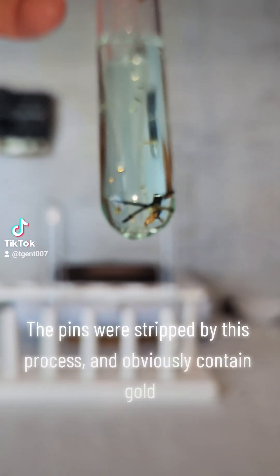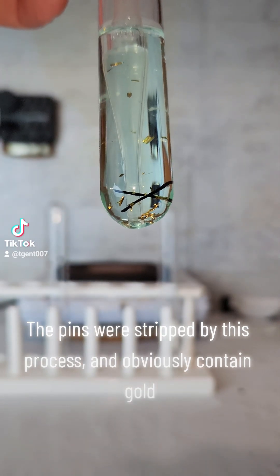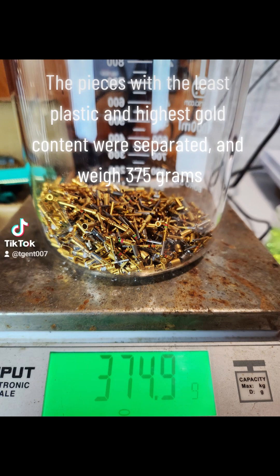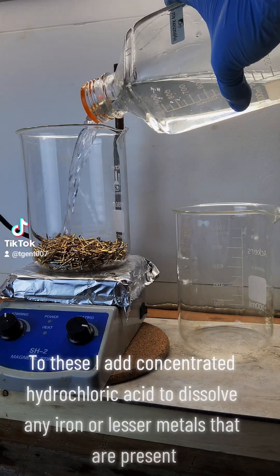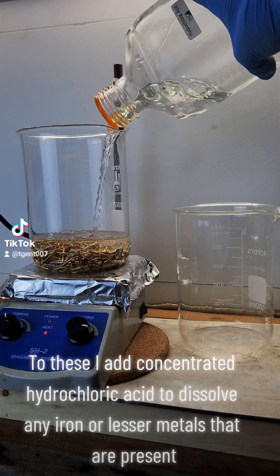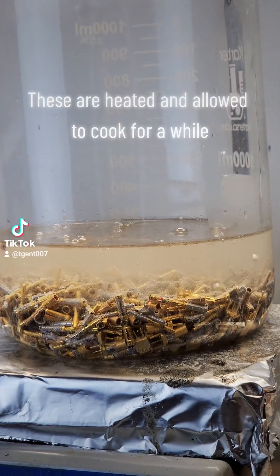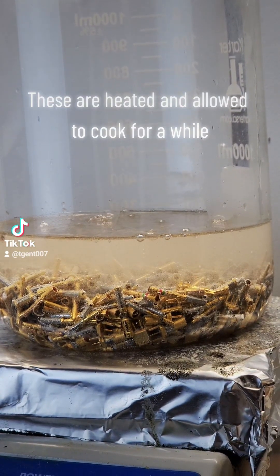The pins were stripped by this process and obviously contain gold. The pieces with the least plastic and highest gold content were separated and weigh 375 grams. To these, I add concentrated hydrochloric acid to dissolve any iron or lesser metals that are present. These are heated and allowed to cook for a while.